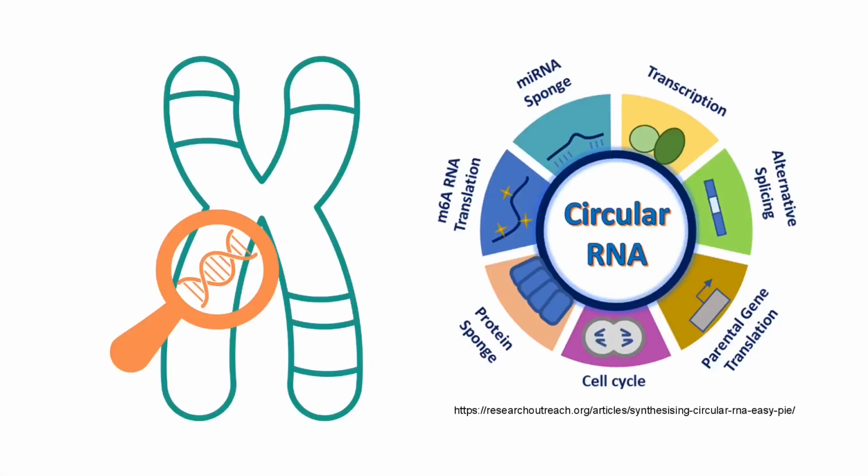Welcome back to Biocode. In this tutorial, I will continue how to design primers for PCR reaction. In today's video, we are going to talk about circRNA and what software you would use to design a primer for it as a target. First, I need to talk about circRNA itself.